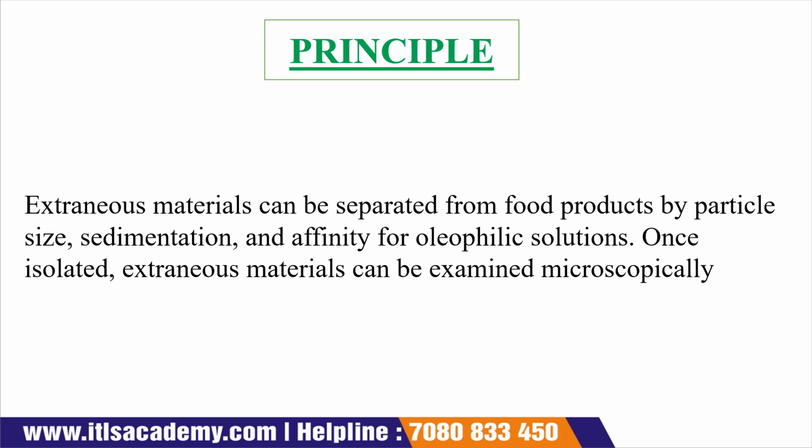First of all, we have to separate this. The separation is based on particle size, sedimentation, and affinity for an oleophilic solution. We use different technologies for the separation. Once it is separated, it will be trapped on a filter paper. Then this filter paper should be examined under a microscope.